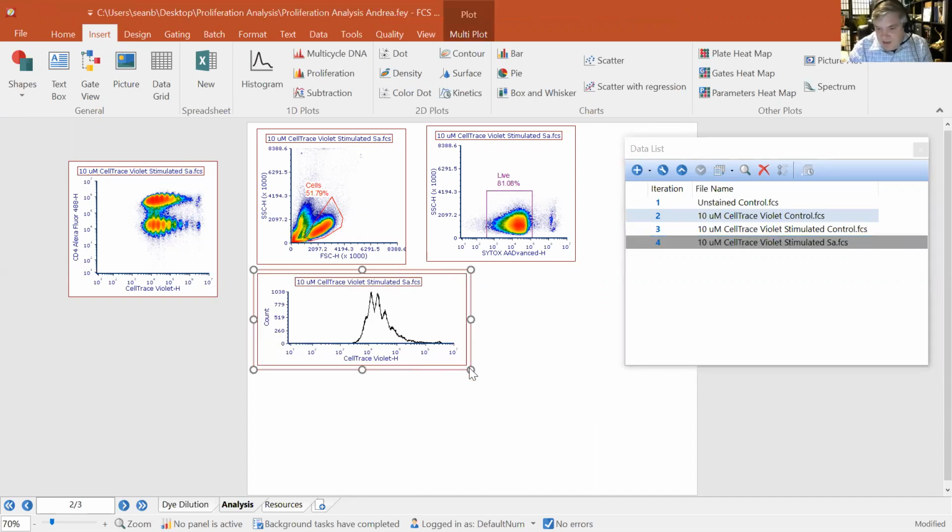Again, this is a perfect world. The data doesn't always look like this, and it may not look like this on your first go around, but if you keep with it and talk to some of the people who know how to put together these assays, your data can look like this. So don't be discouraged if it doesn't look like that immediately.